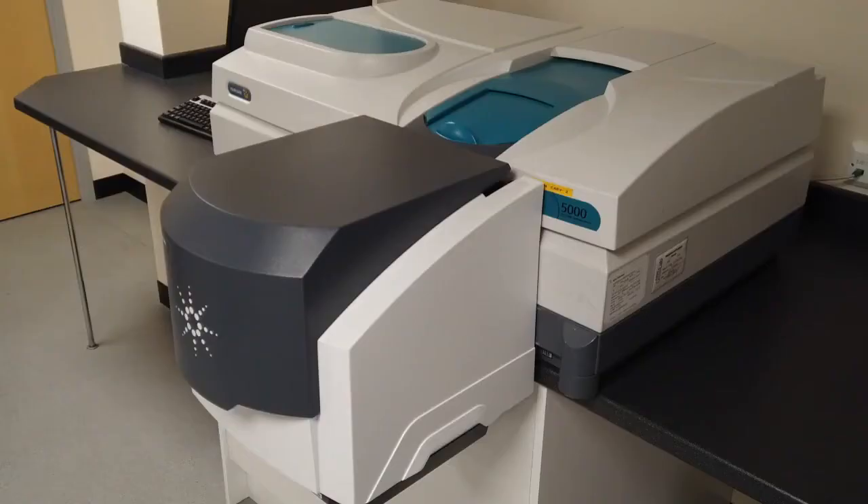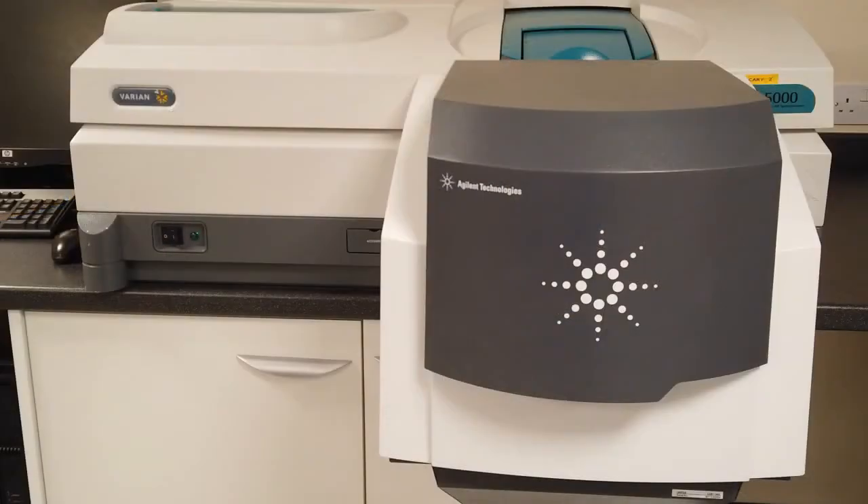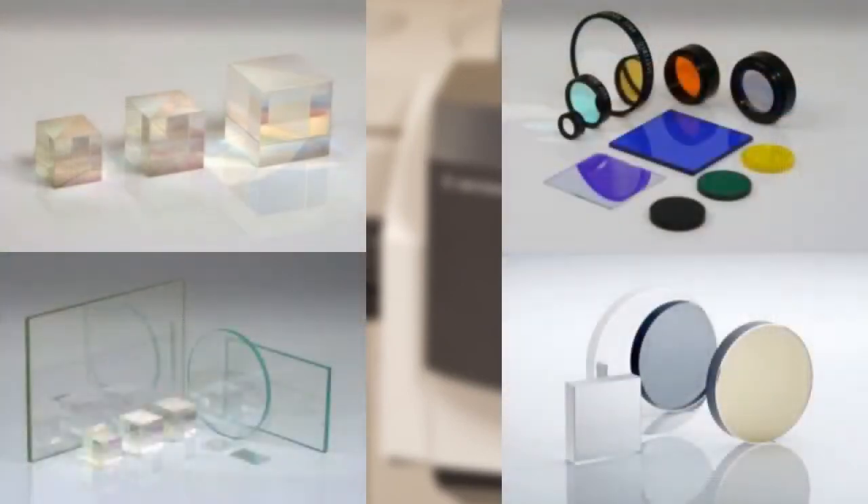Because of the versatility of the Kerry 5000 with UMA, we are able to measure spectral characteristics of a variety of optical components such as cube beam splitters, plate beam splitters, dichroic filters, mirrors, and polarizing optics.